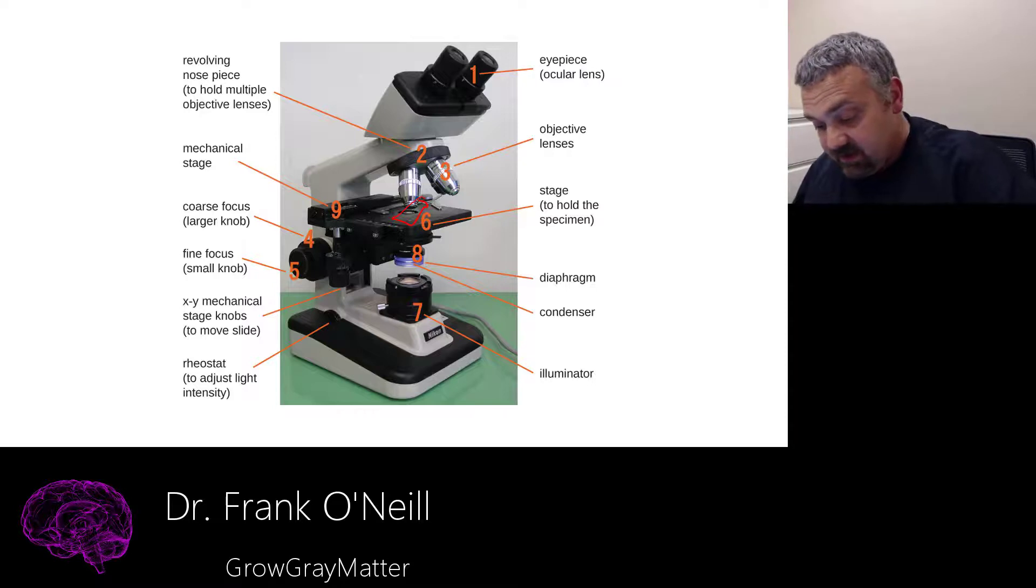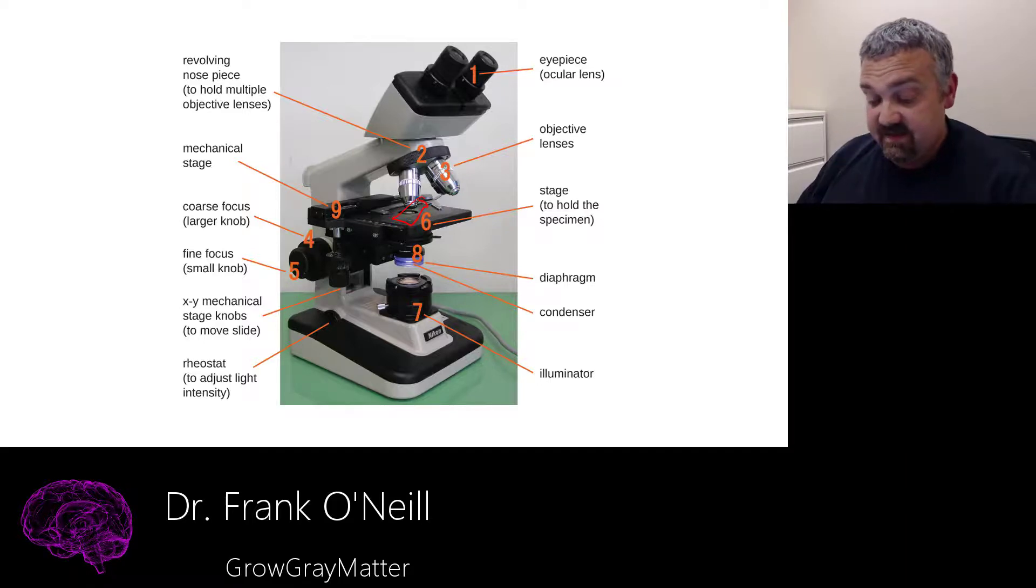Number eight is, as you can see here, a couple of things are pointing here, the condenser and the diaphragm. So the condenser is going to condense the light from the light source. And the diaphragm will allow you to open and close the aperture to determine how much light will enter the stage and the specimen.